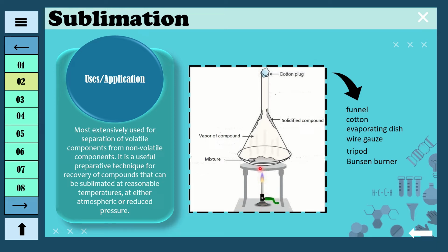What will happen here is that the crude product containing a mixture of volatile and non-volatile components is separated. To further understand this, you have to know that volatile components are substances that are easily evaporated at normal temperatures, like the chemicals benzene, ether, or hexane. This means that under the sublimation technique, the mixture of volatile and non-volatile components is subjected to a certain temperature and reduced pressure.